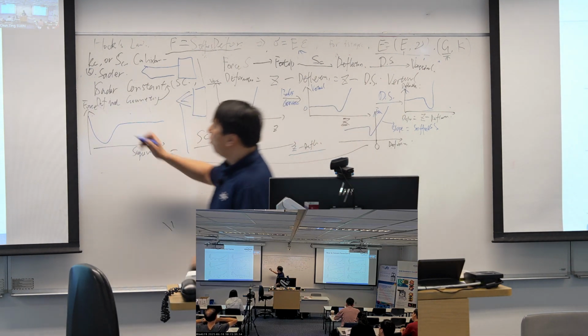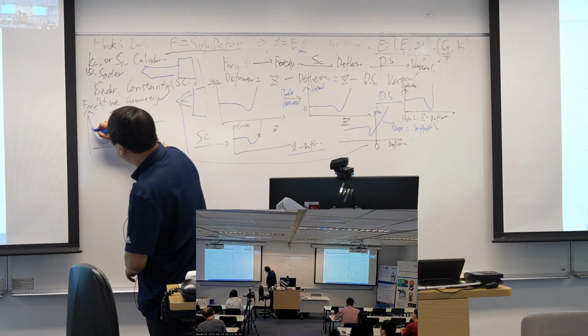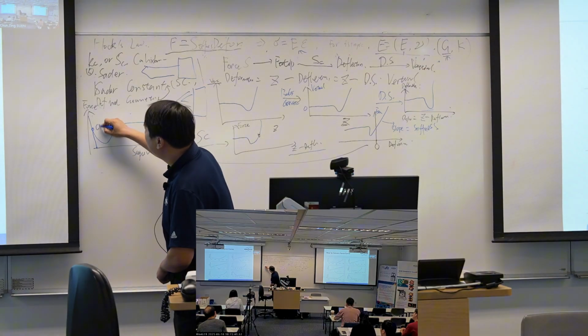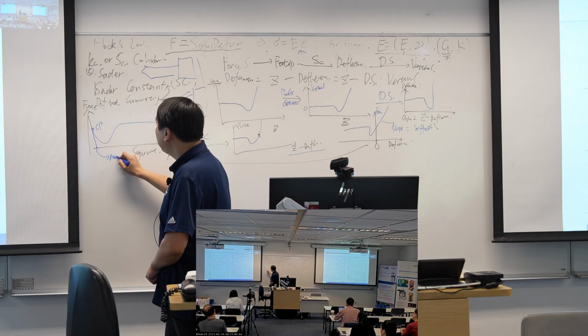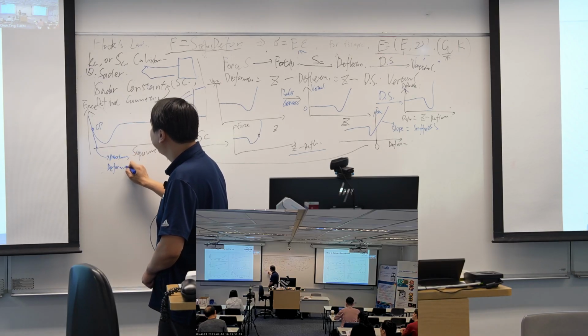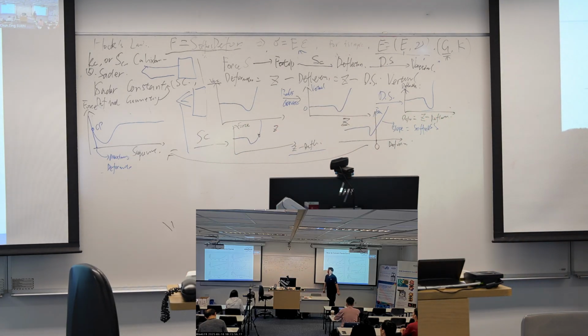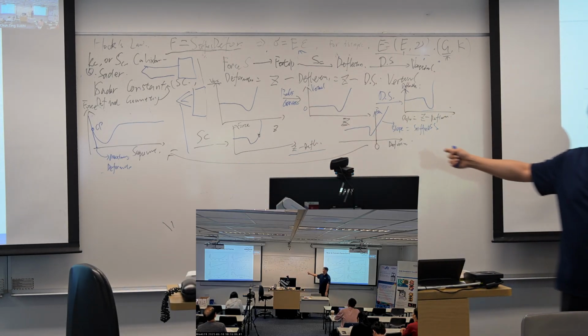And again, we can still find out that the contact point is somewhere here. And the separation value at the contact point is the maximum deformation, right? That's the maximum deformation. So it's kind of a stupid thing. I'm sorry. It's hard to understand. The other kind of expression is straightforward.